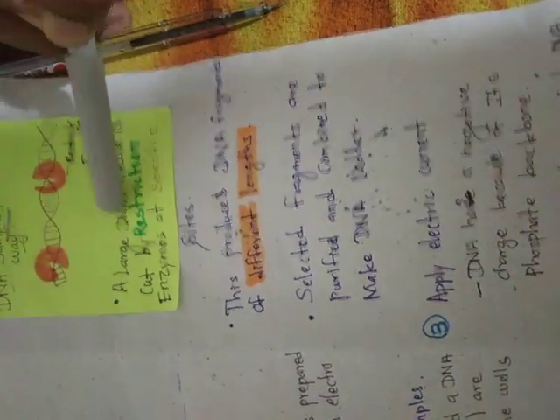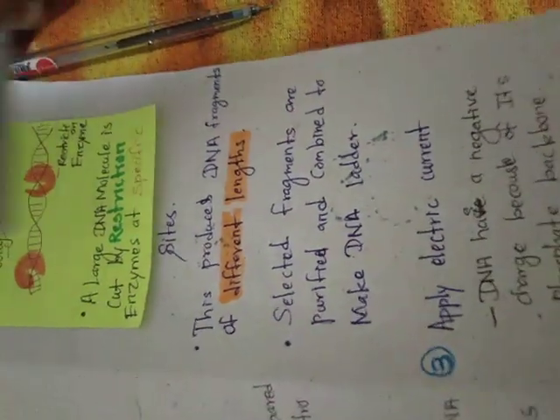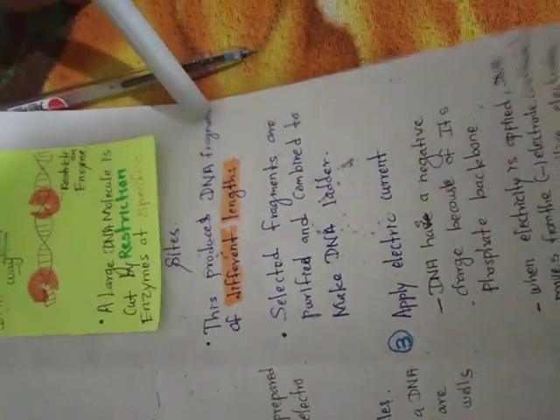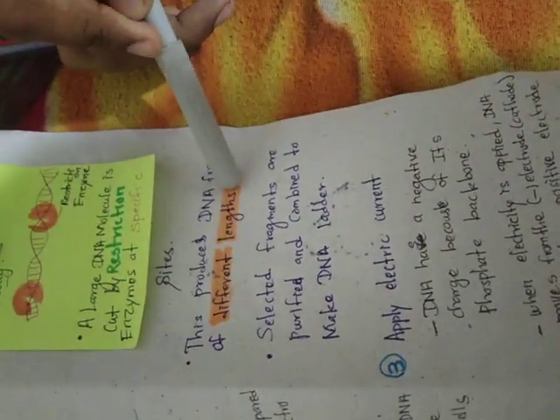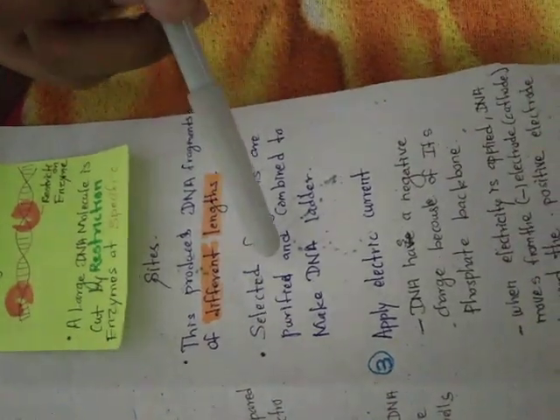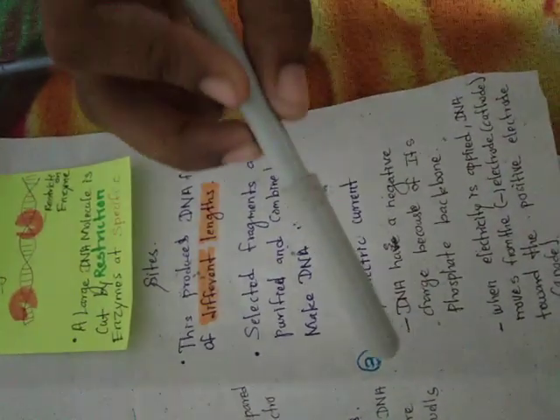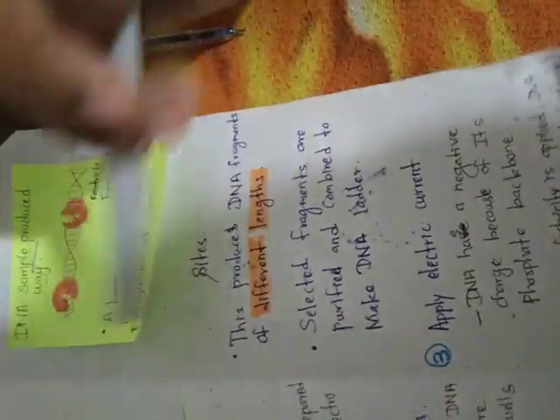A large DNA molecule is cut by restriction enzymes at specific sites. This produces DNA fragments of different lengths. Then selected fragments are purified and combined to make DNA ladders. Then this is the DNA sample process.